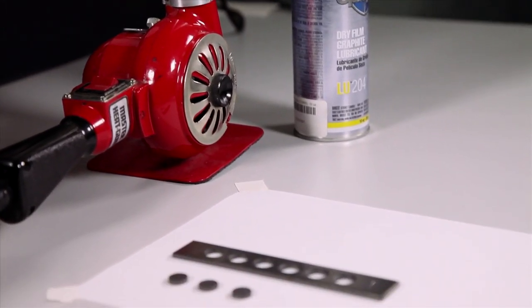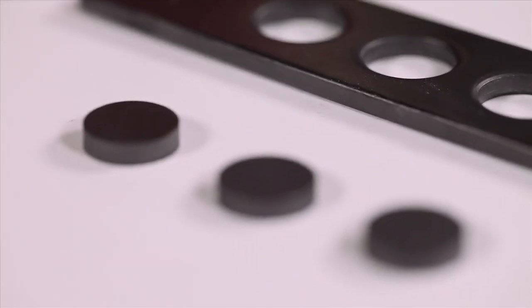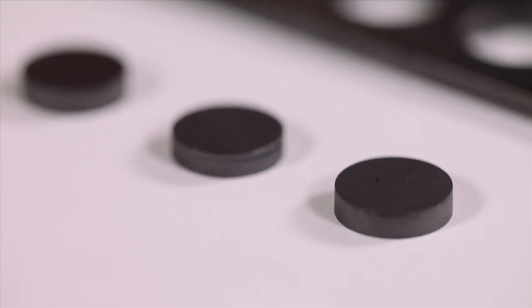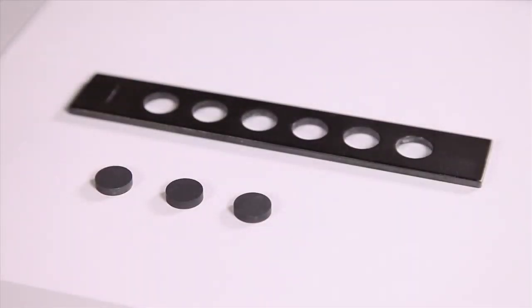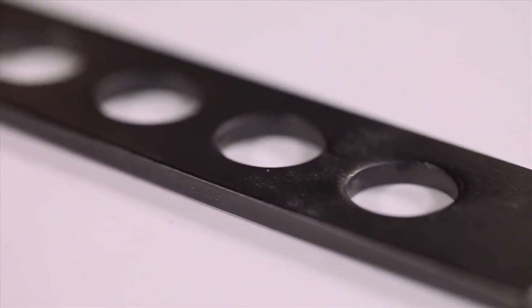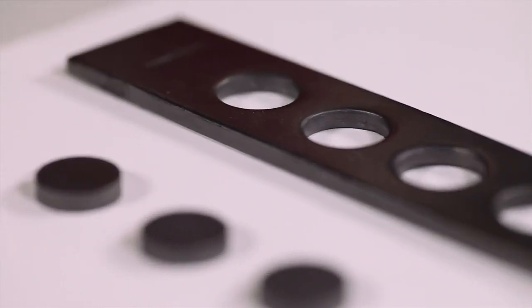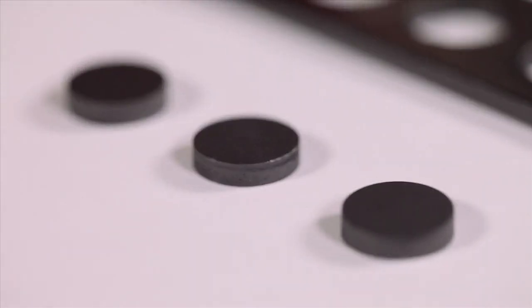The main goal of sample preparation for laser flash is to make the samples opaque to the laser beam. You want to make sure that all the power of the laser is absorbed by the sample and none of it goes through it. For this reason, we use a thin layer of graphite on both sides of the sample.